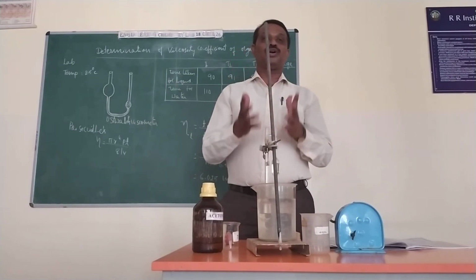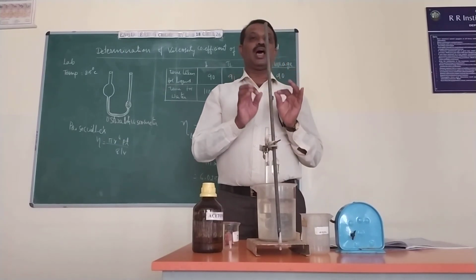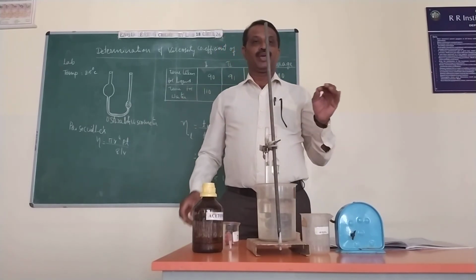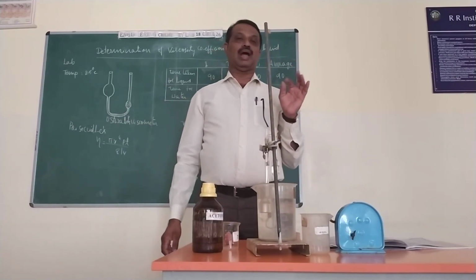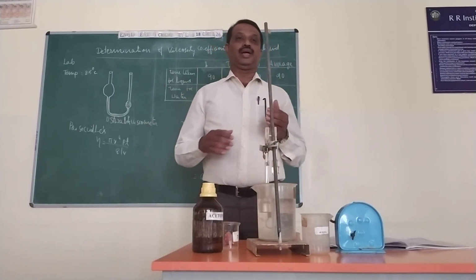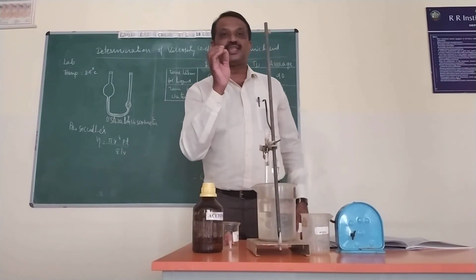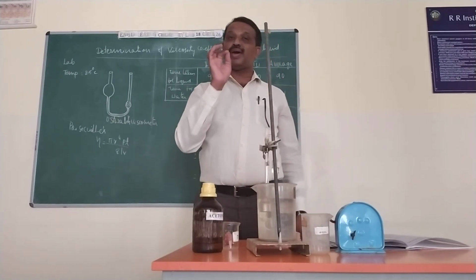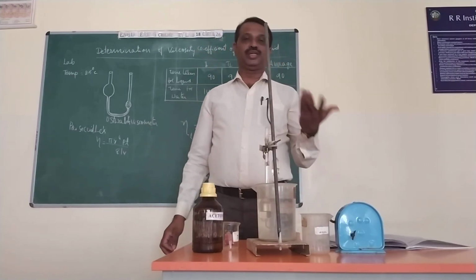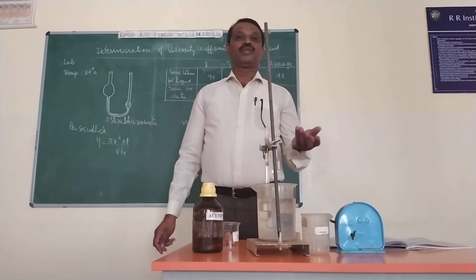Otherwise, you won't get the exact viscosity coefficient, which we have already determined in our lab, along with the lab temperature record. The minute sizes inside the capillary tube vary, so if you use a different one, we can get the wrong result, we can get an error at that time.